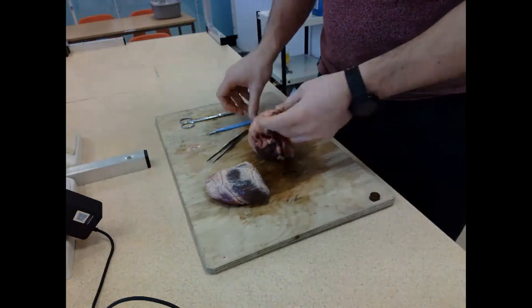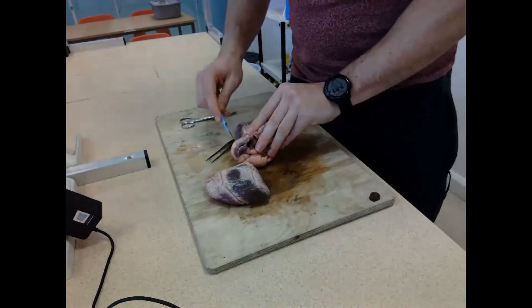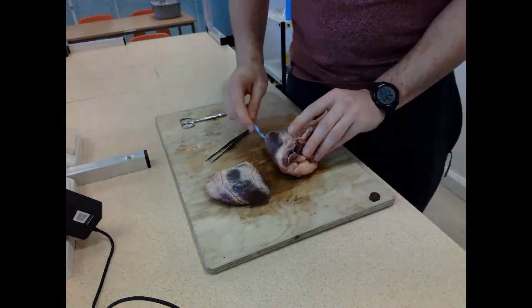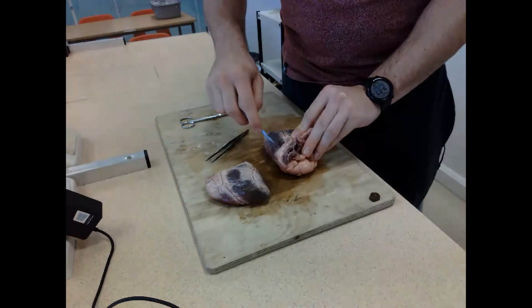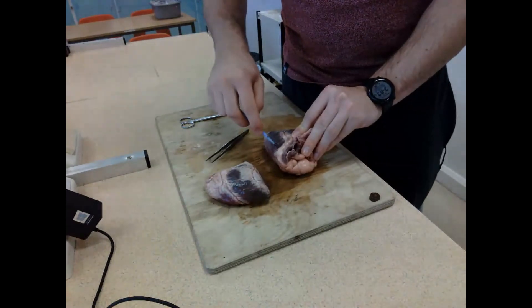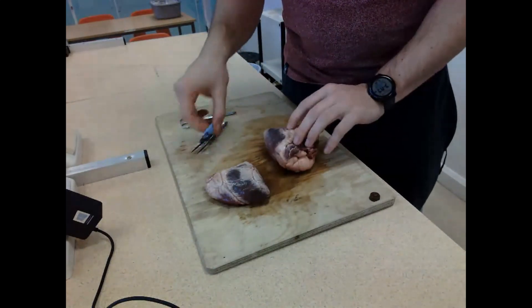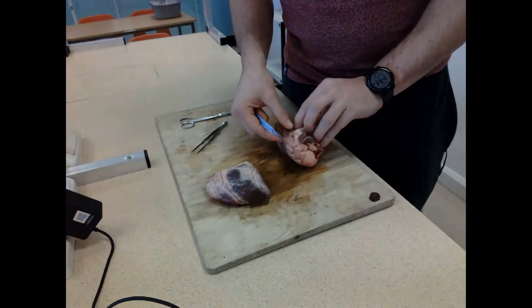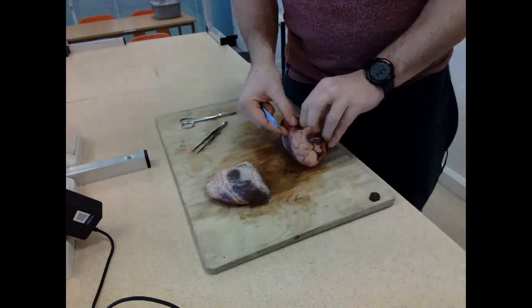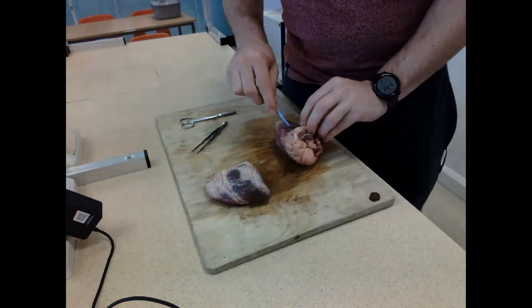I'm checking I'm cutting on the right side by testing the wall thickness with my fingers, pinching either side. I'm going to make a few short sharp cuts into the right atrium - I know it's the right atrium because I'm going to put my finger in through the vena cava and it will pop out through the hole I've just made, confirming we have the right atrium.